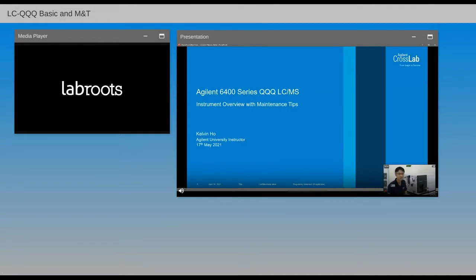All right, so today we are going to go for a 6400 series Agilent LC Triple Quad webinar. My name is Kelvin, and I'm one of the trainers from Agilent University for this product line. And we're going to have an overview and maintenance tips covered over about 45 minutes.